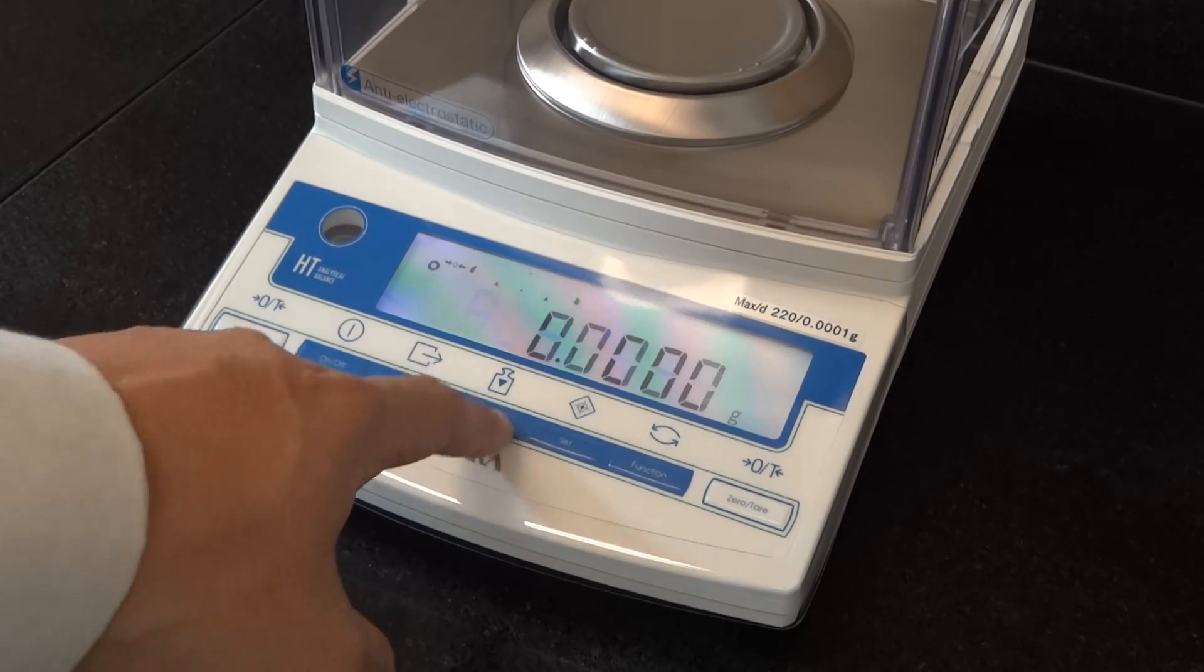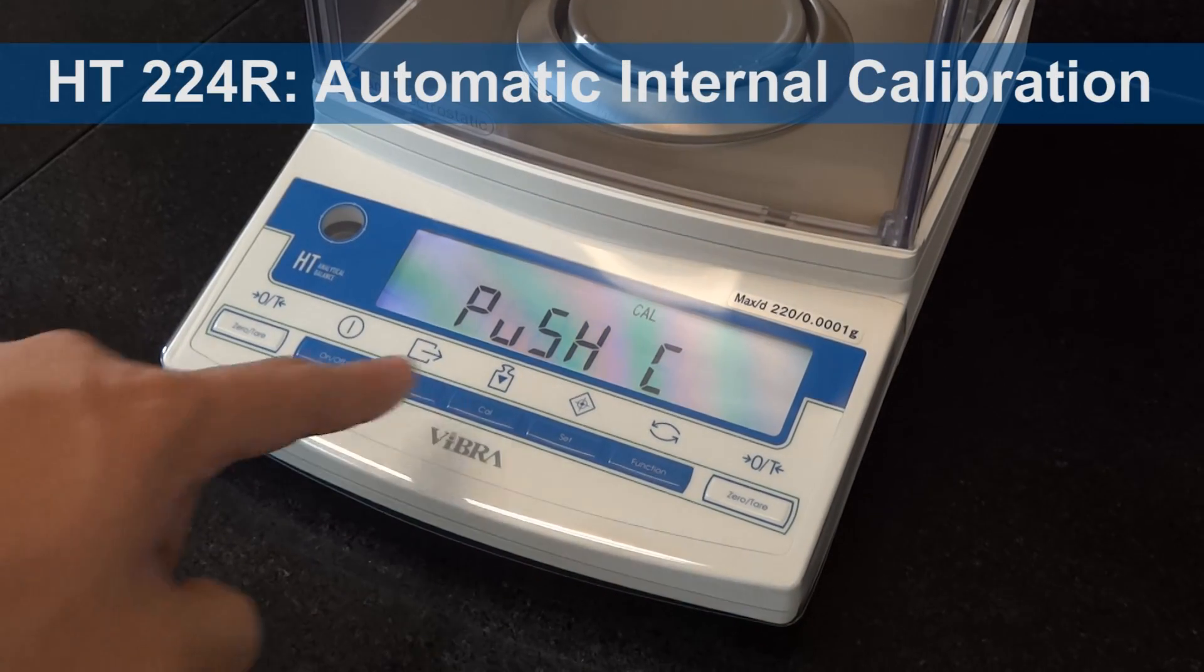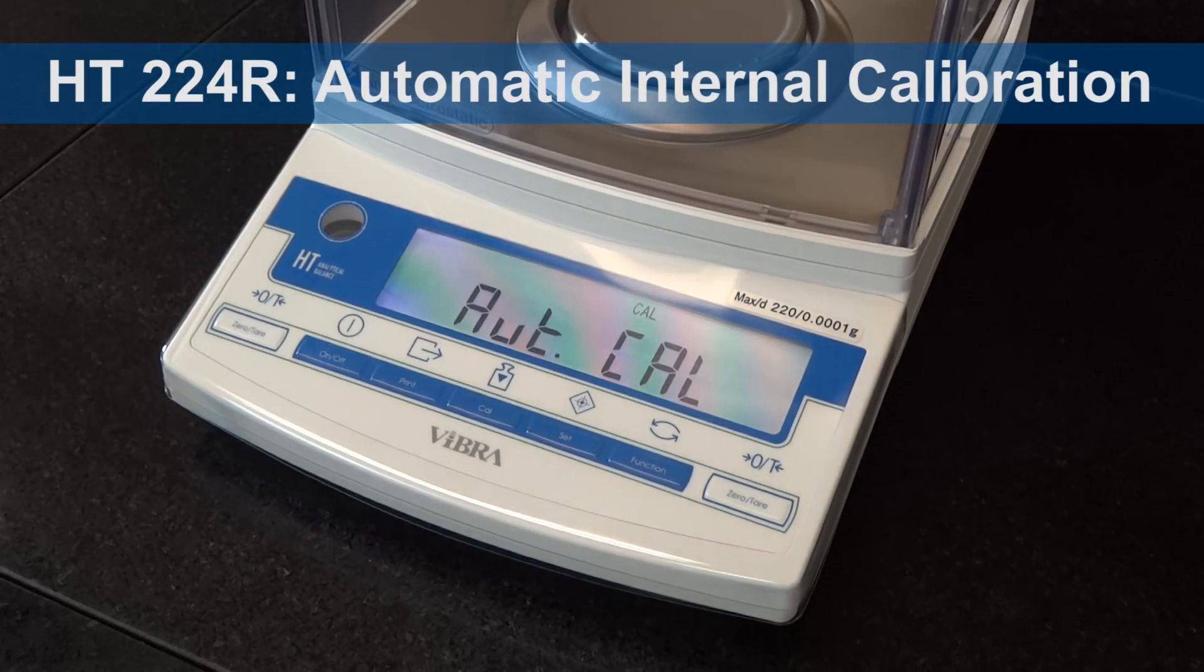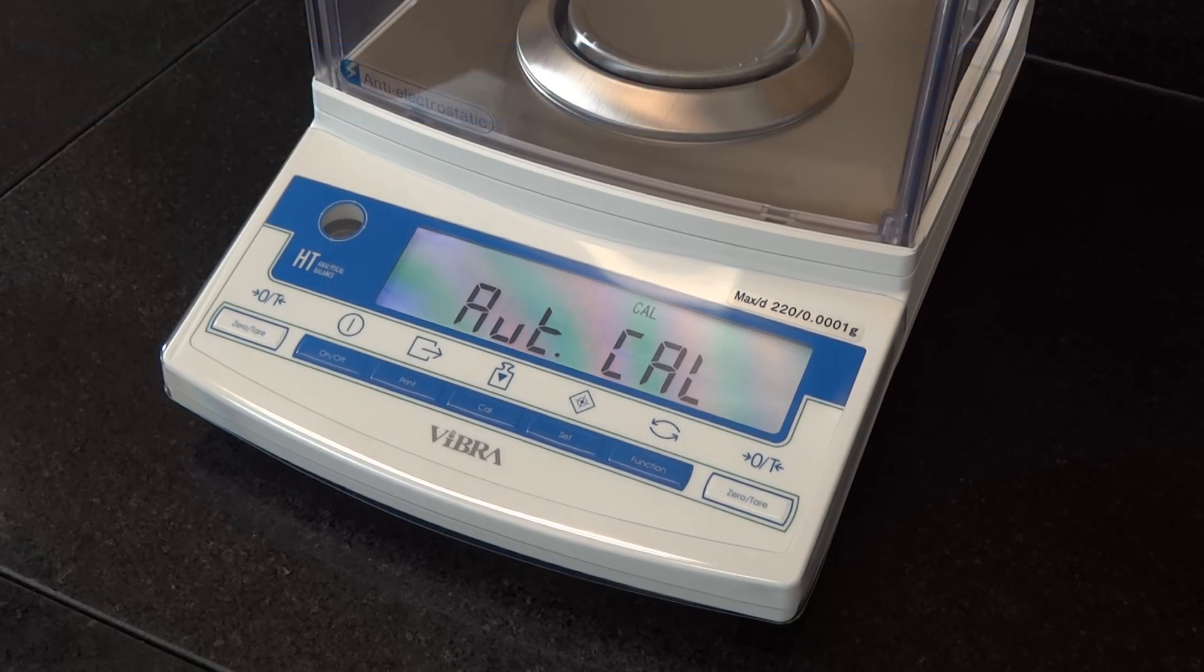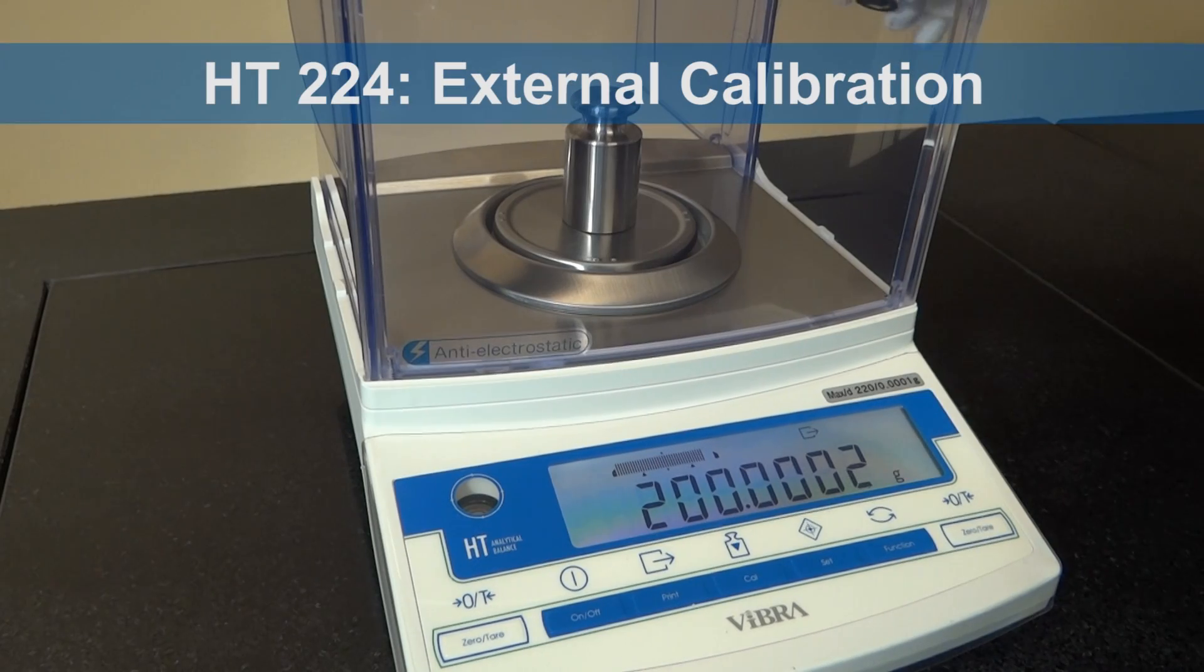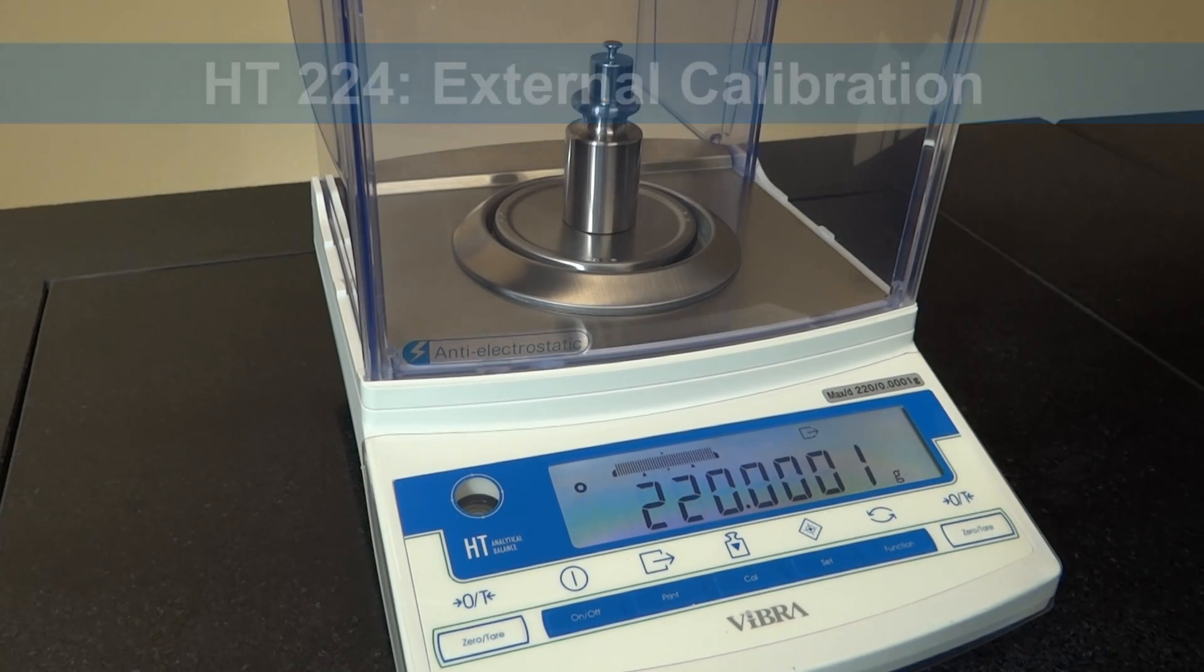Two versions are available. The HT224R offers automatic internal calibration at the push of a button. The HT224 has external calibration and can be provided with a test weight.